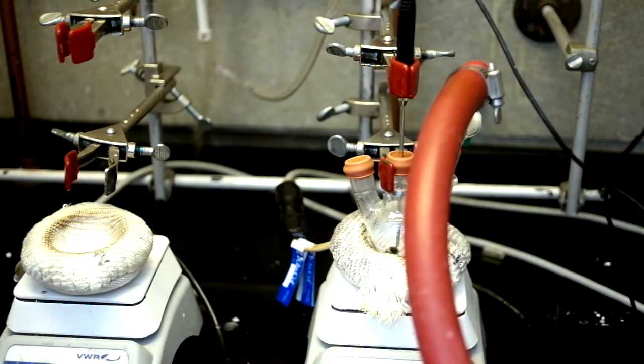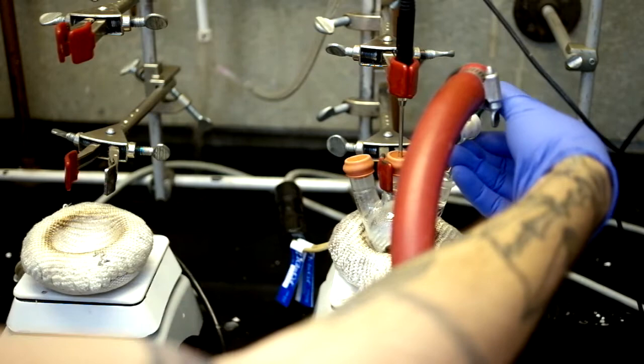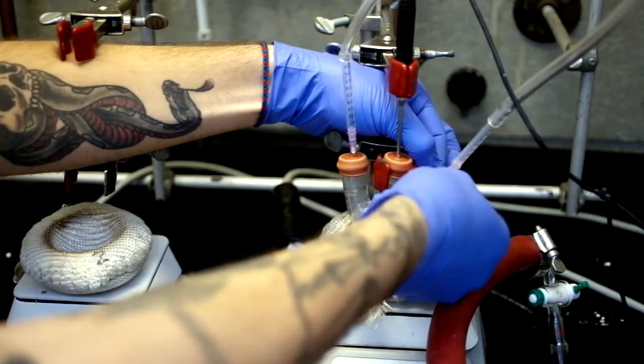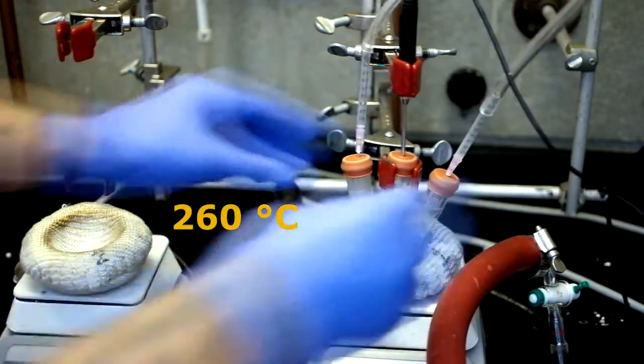You can now take the other flask with the OA and ODE and take it off of the vacuum as well using the same procedure. Once it's under argon, raise the temperature to 260 degrees Celsius.